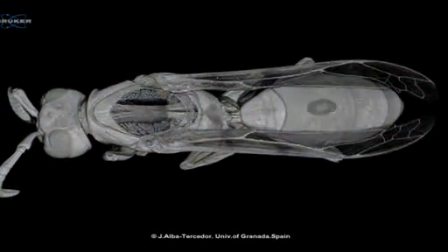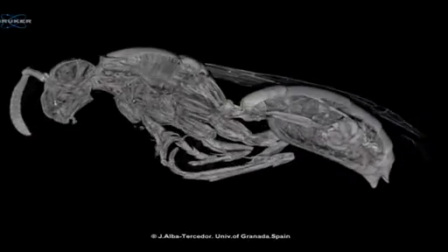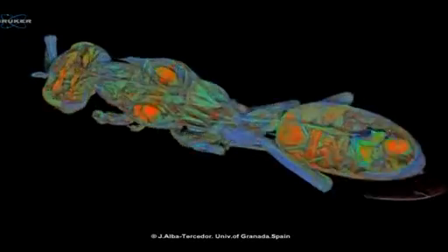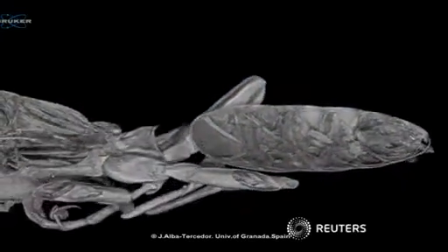The X-ray scan also gives a unique view of the insect from within, without the need for dissecting and thus destroying the specimen. Professor Alba-Tercedor uploads his videos online to help others answer some of the insectoid questions that have long bugged scientists.